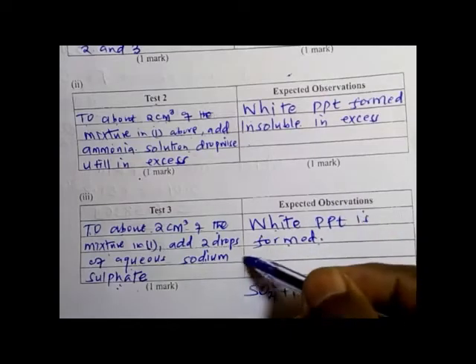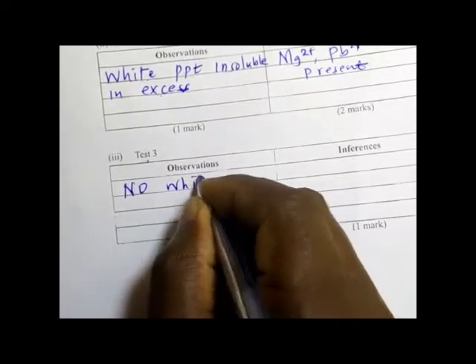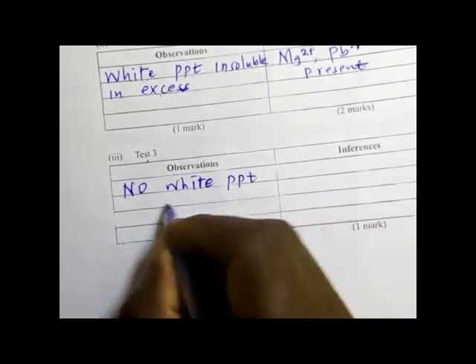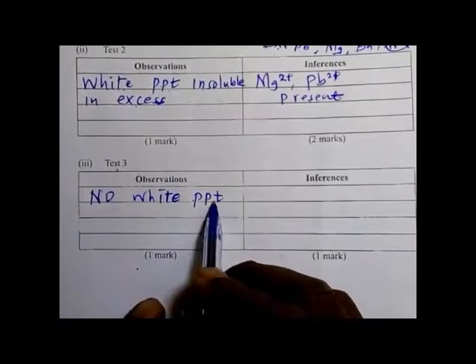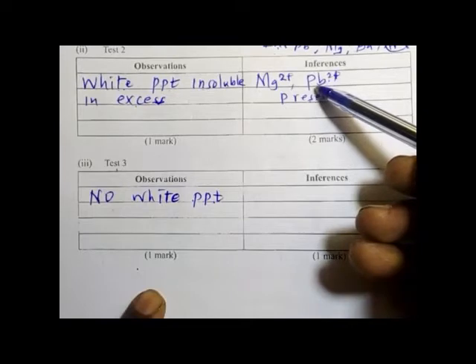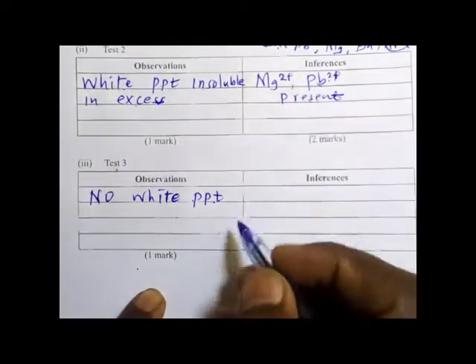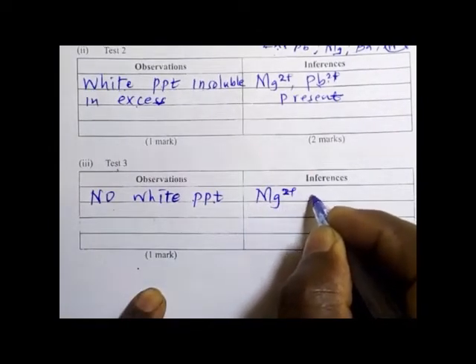But on doing the experiment, this was the observation: no white PPT was formed. If there was no white PPT, then it means lead ions were not there, because if the lead ions were there, they would form a white precipitate. So here we say magnesium 2 positive was present.